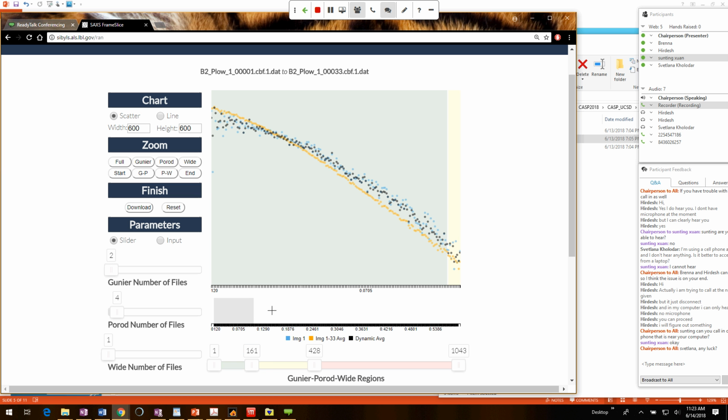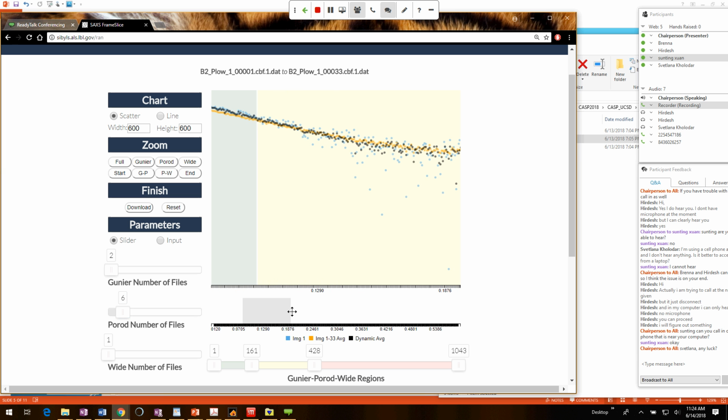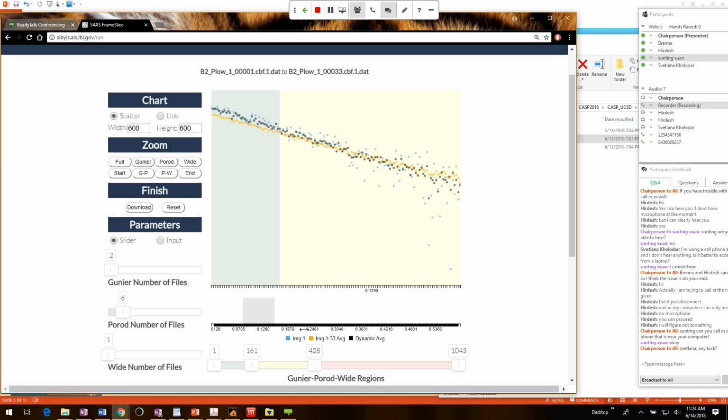So now I'm going to look a little bit further here, and I'm going to add frames, and now I'm going to zoom in from the other side here. And now I can use 6 frames in this area without having radiation damage. So there's basically 6 parameters that you can play with in this GUI. There's the number of frames that you have in the Guinier region, the number of frames that you put in the Porod region, the number of frames you put in the wide Q region, and how big those regions are. So let's say I'm happy with 6 in this area.